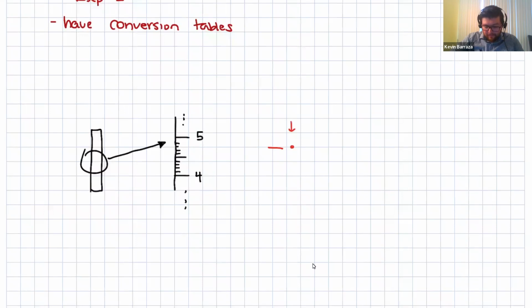So here's my decimal place. Which digit is it? The 0.1. The 0.1 being the tenths place, right? Because each one of these is 4.1, 4.2, 4.3. So that means that this and all above digits, those are my certain digits.